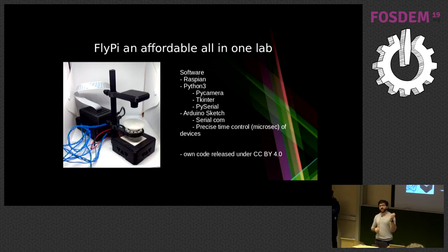So the application with the automated focus is still not complete. So right now it's really just pressing a button and making it move. So we don't have the algorithms to make it automated yet.